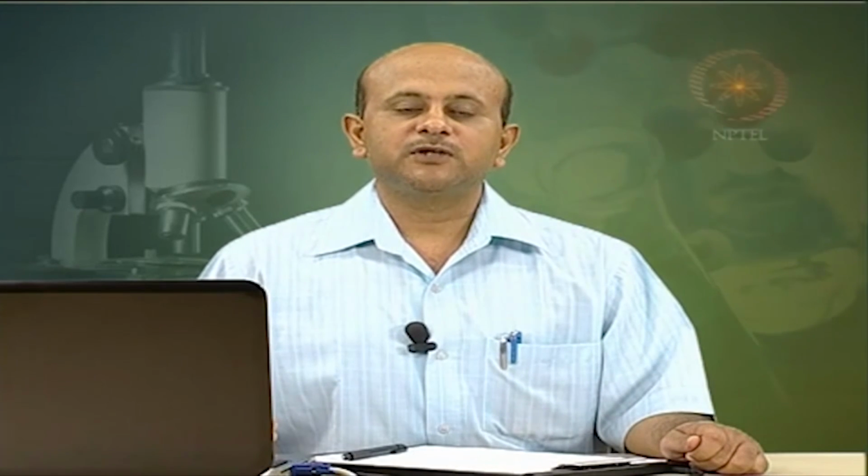Each fringe traces a curve of the refractive index gradient against distance in the cell. Since the position of the fringes is determined by solute concentration, it is possible to measure the concentration of solute at any point along the cell. So for higher sensitivity, many systems utilize the Rayleigh interference optical system in place of the Schlieren system.